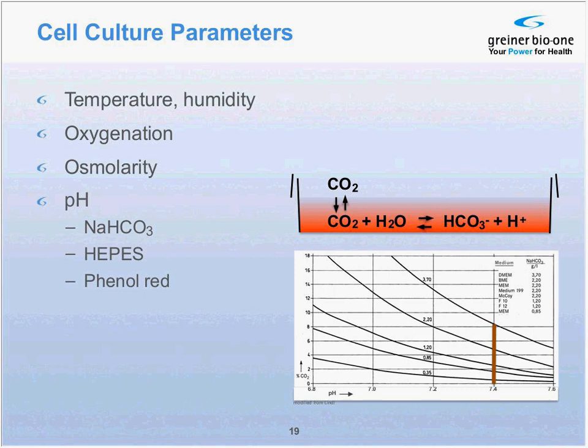The diagram illustrates the dependency of sodium hydrogen carbonate in the medium on CO2 in the incubator.